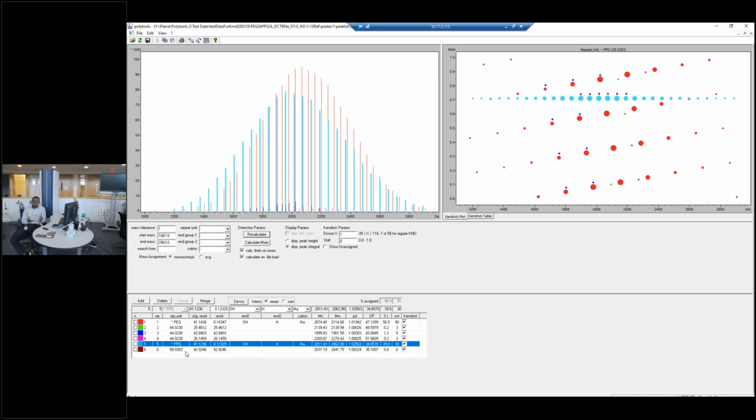And also, if you have a surface and it's taped on there, you can easily remove it. And I've used the same target for very long periods of time. Barely had any chipping or any changes to how the surface of the target looks. You would have to put some effort and energy into it to be able to chip the target. Hopefully that answers the question. Thank you.